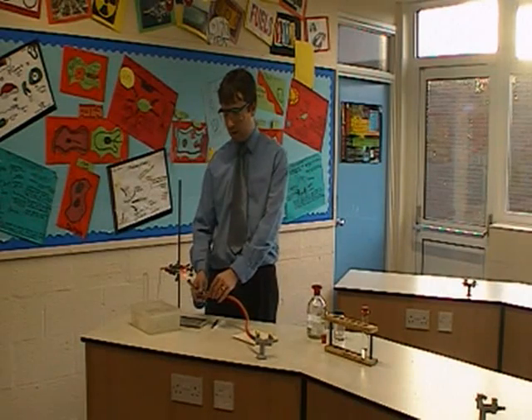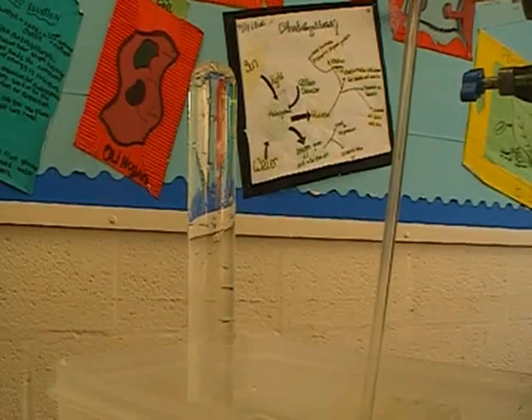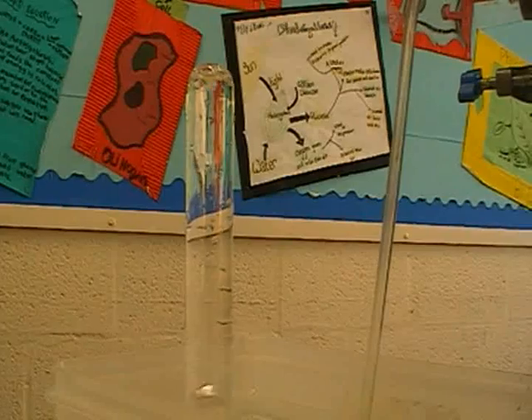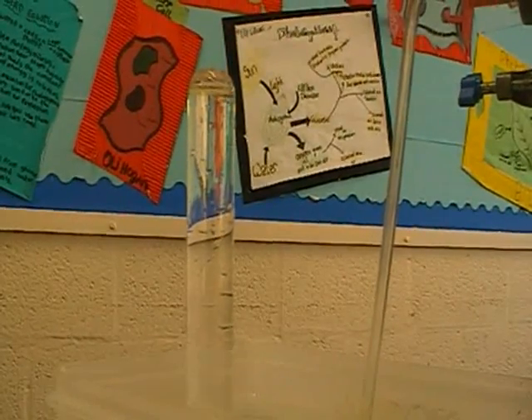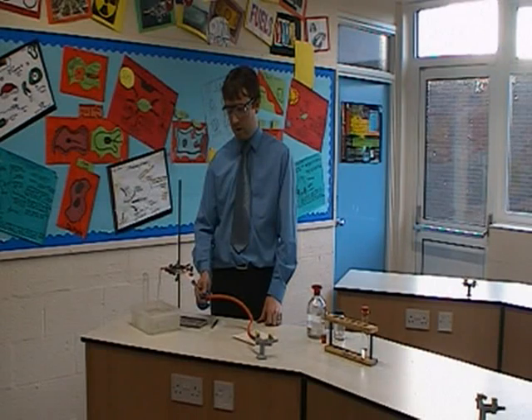You can see now that we're starting to get some bubbles produced in the boiling tube. As the reaction starts to happen properly — as I said, this is air at the moment — we'll start to see a cloud of gas billowing towards the top of the test tube, which is telling me that the reaction has started to take place.